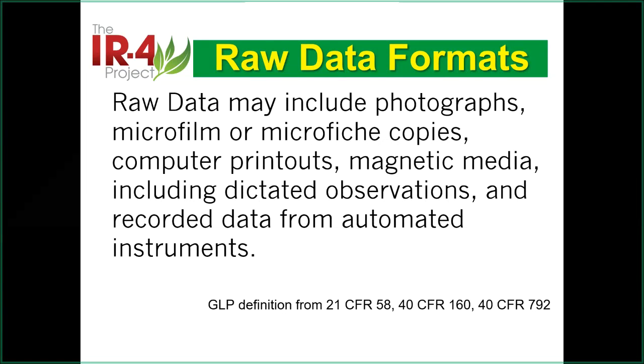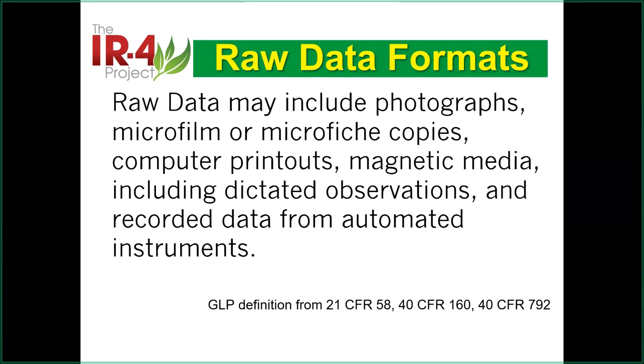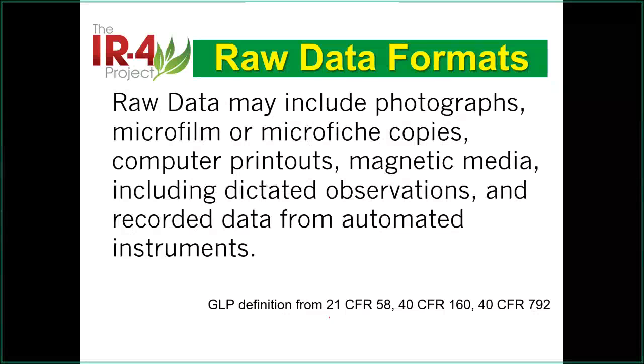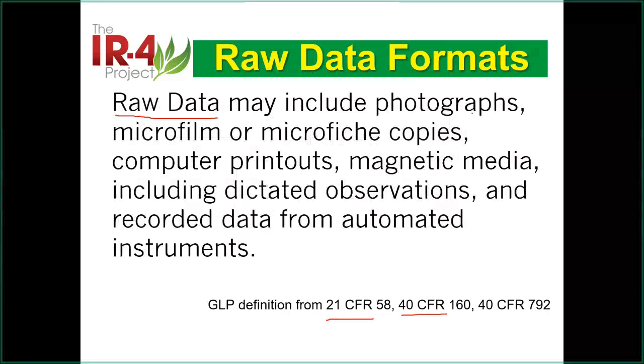Yes, you can use electronic data, yes, you can, but that will make things very complicated. If you cannot validate, a lot of things, you may not be able to put things together. So again, this is FDA GLP and EPA GLP, and again, it says what is raw data. So all the raw data here is everything. What was it, about 40, 50 years ago? They say they take a picture, photographs, it should be. That time it was microfilm, but of course, nowadays you can always say electronic related data.